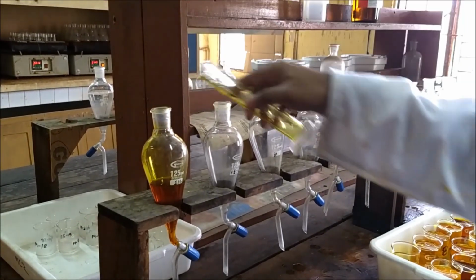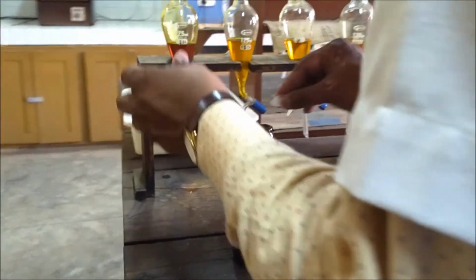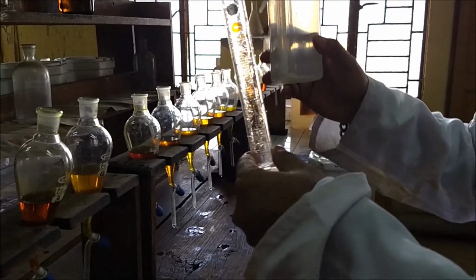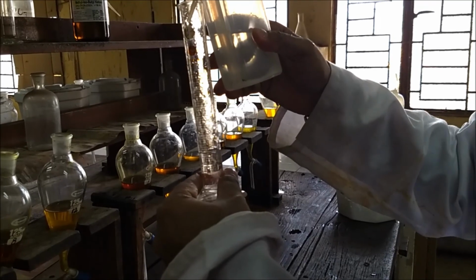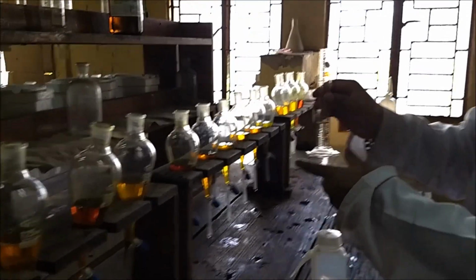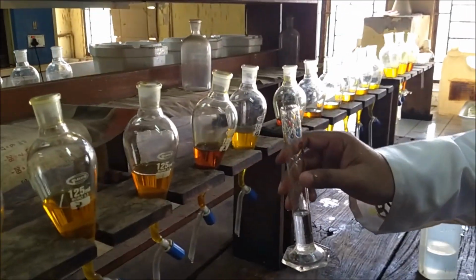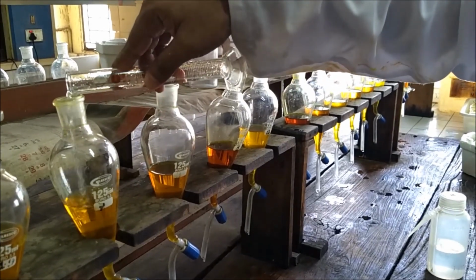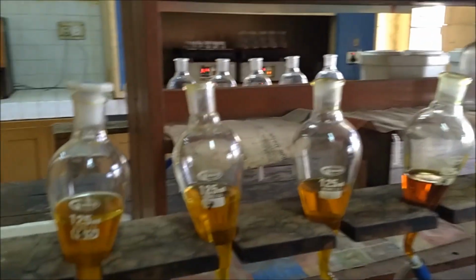After this, measure 10 ml of MIBK with the help of a measuring cylinder and add it to the separating funnel. Here we are maintaining a 5:1 aqueous to organic layer ratio for optimum extraction. Remember, take proper safety precautions while using MIBK because of its acute and chronic health effects.